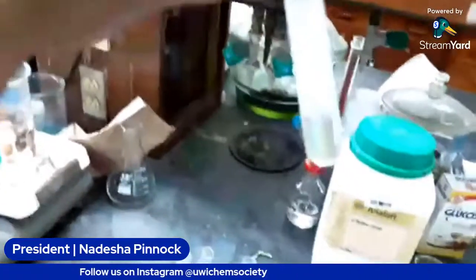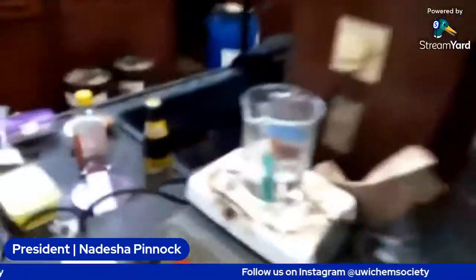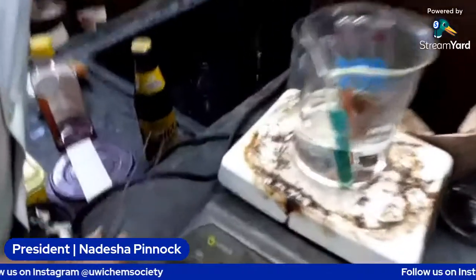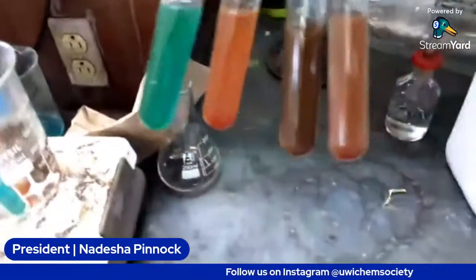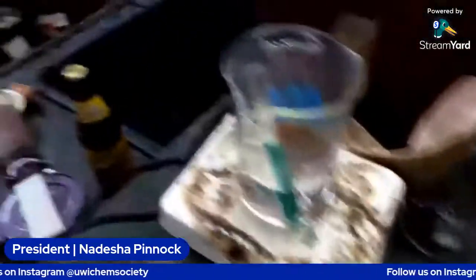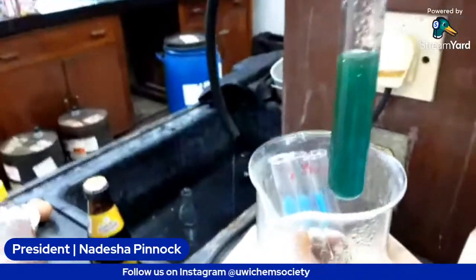Alright, so we're going to allow it to sit and then we add some water to it. So in the meantime, we have our reducing and non-reducing sugar test. So we're similar to what we saw before. These are the ones we had before, and as you can see, it's a similar thing that we have here. So this is the sugar, or the sucrose that we have.